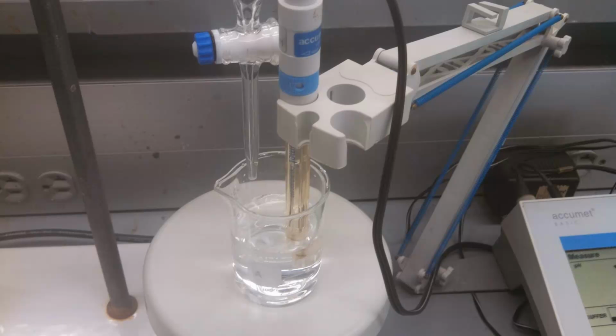You'll take a 150 milliliter beaker, put it on the stir plate once you've pipetted everything that needs to be in it. You'll put the stir bar in there and arrange the burette and the electrodes so that they're both over top of the beaker. You need to make sure that the tip of the electrode is fully submerged in the liquid in the beaker, and that the burette, when you dispense a drop, is going to fall into the beaker. You can turn on the stirring at this point too. Start off very small. Some of the stir plates are powerful and they'll splash liquid out of the beaker if they stir too hard. You don't want that to happen.